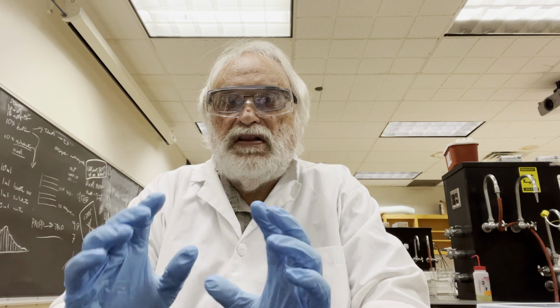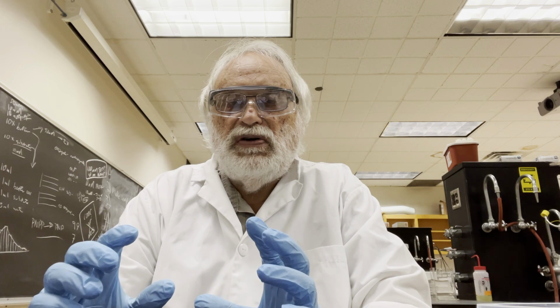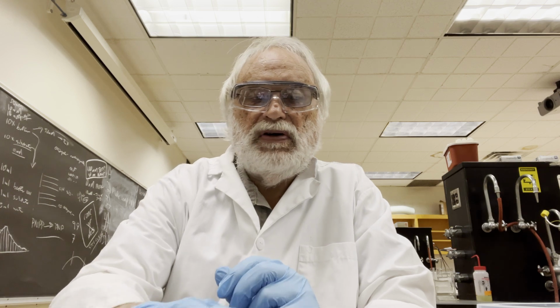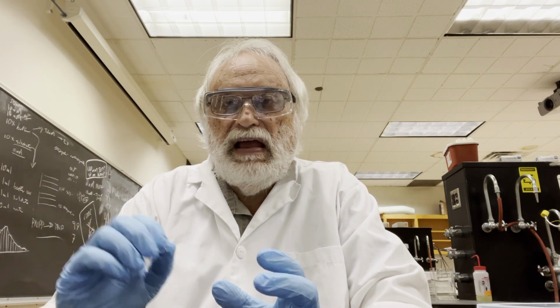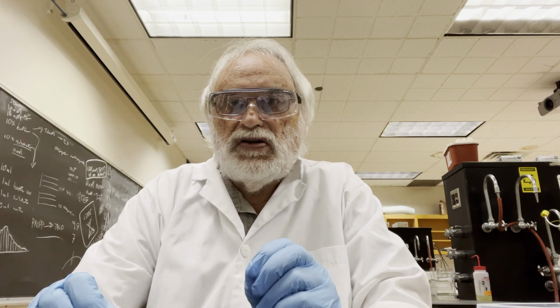And now we're going to the final experiment of the semester, and we're going to do this 2 weeks in a row, just to be able to reproduce our data. We will determine some of the enzyme kinetic parameters for our mutant enzyme, and we'll actually assay the wild type enzyme at the same time so we can make direct comparisons about activity. Let's go ahead and get started on that.